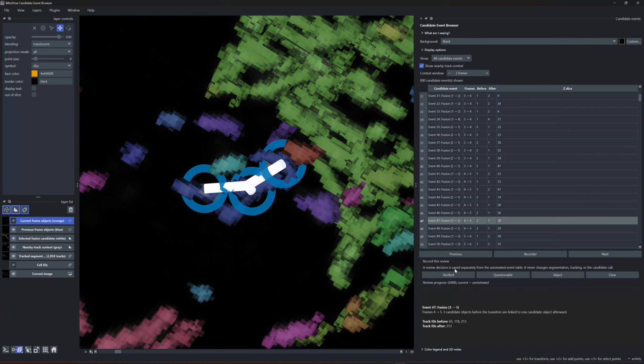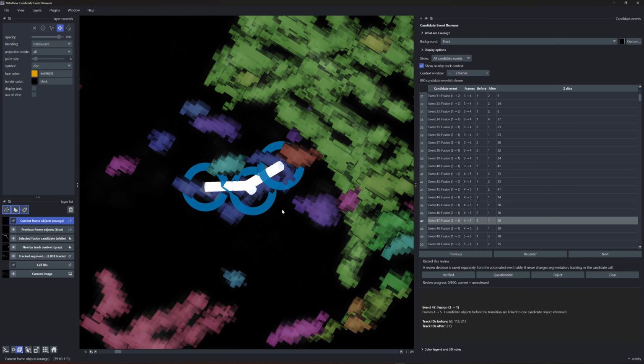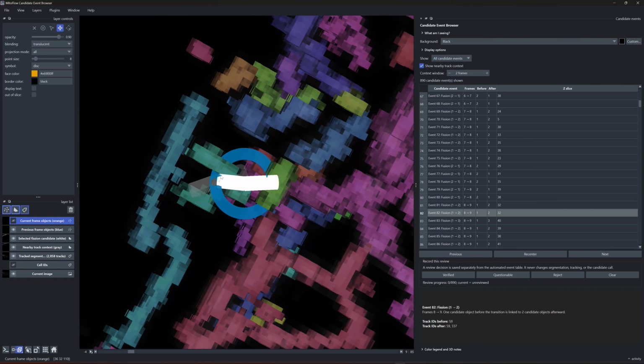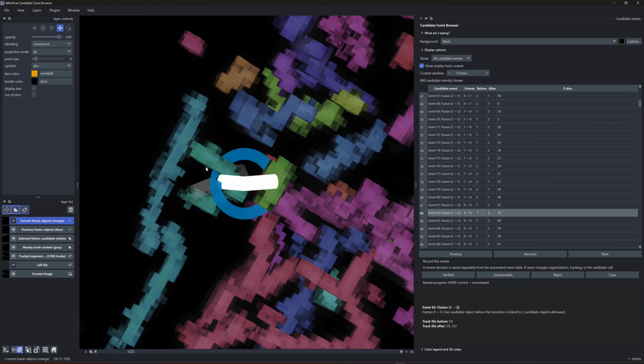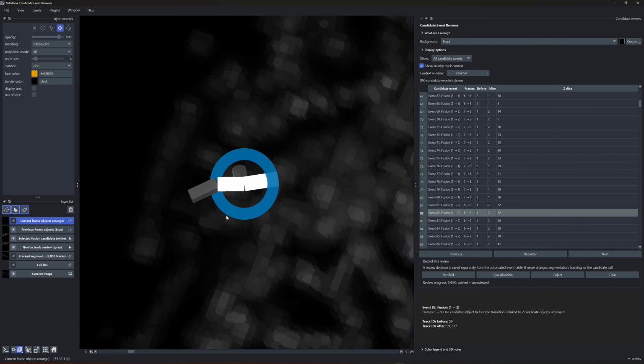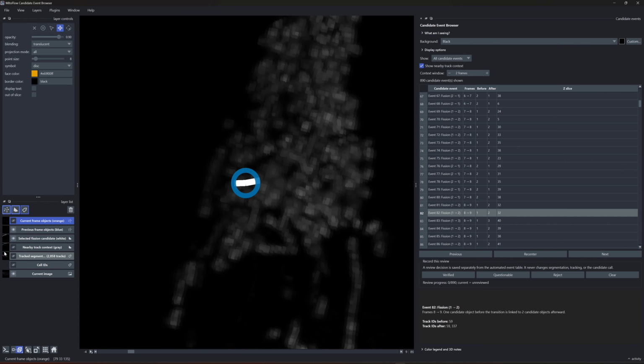You can accept, you can say here verified, reject, clear, or questionable, so that you get a metric out, a sort of a ratio of how many correct to incorrect events the program detected, and then you can report those if you need to. But this for me is very handy because I am a visual person. I want to be able to pan around and see if the events are truly happening. There's also nearby tracks that you can turn off, because if there are any nearby events happening, you will have the proximity of those events. And in some cases, you may actually want to know. Anyways, in my case, I wanted to know. So I have that designed in.